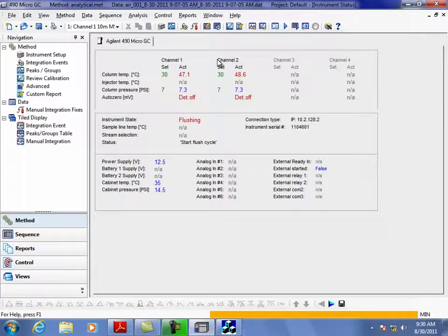When we're talking about limited sample, how big a sample are we talking about? Do you know? Well, I'm thinking on the bio, if anybody knows, fermentation process. Don't know? For yours on the gasifier, you won't ever use it. There won't be a syringe injection.